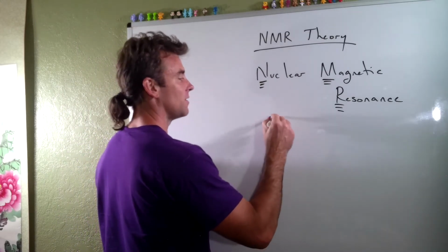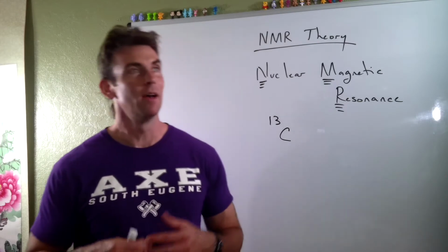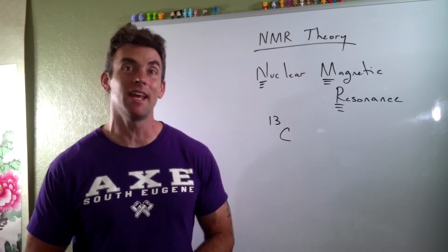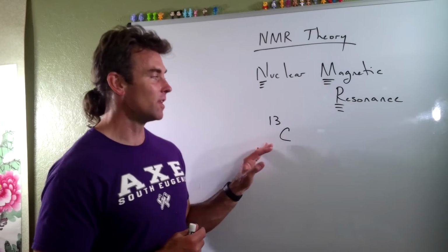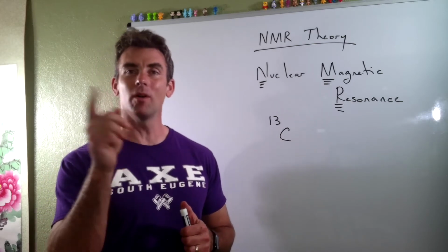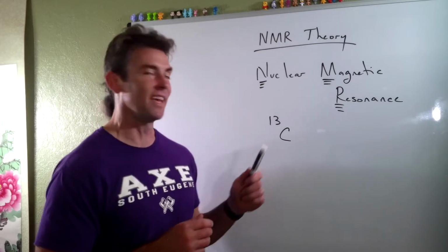Right? And that C13 just corresponds to a particular isotope of carbon, much like you probably learned about when you talked about C14 dating and things like that. It's just a carbon with a certain number of neutrons, right? It turns out that this nucleus can either spin one way or the other way. And because it's quantized, that's the way that this thing lives.